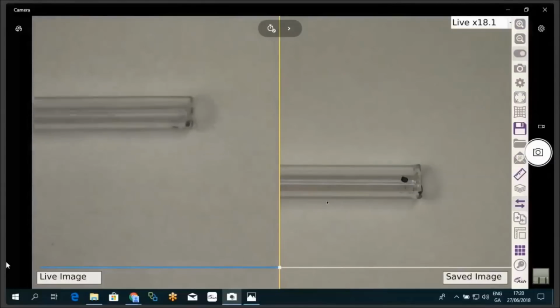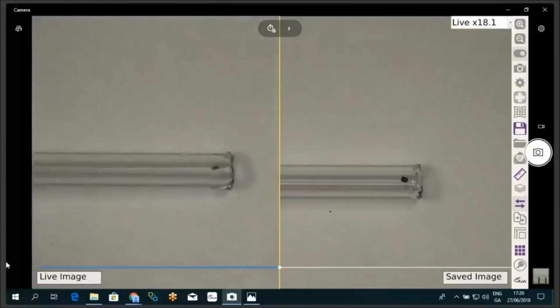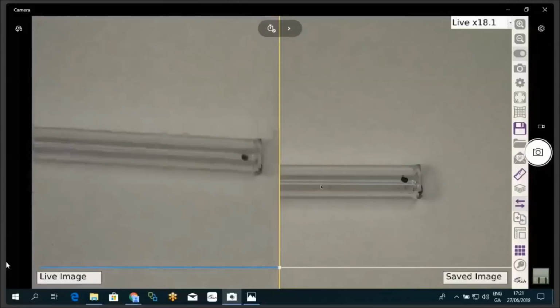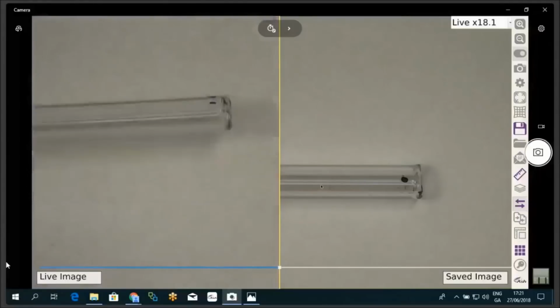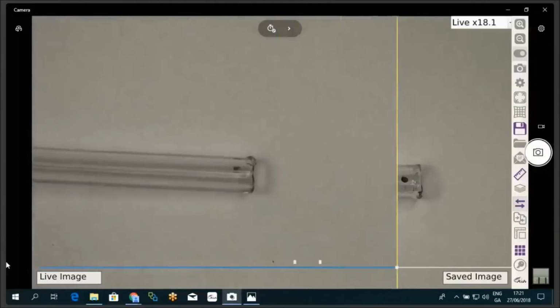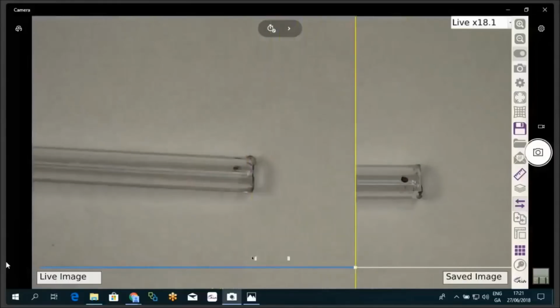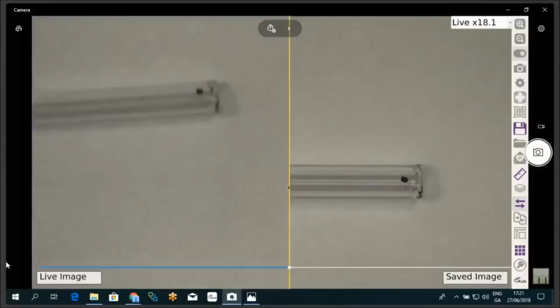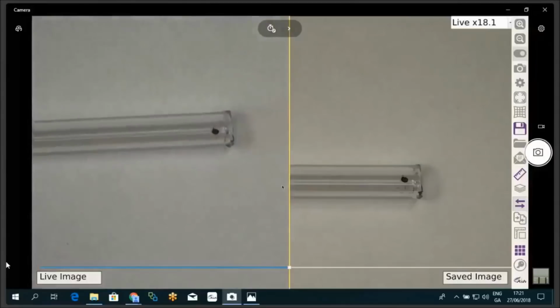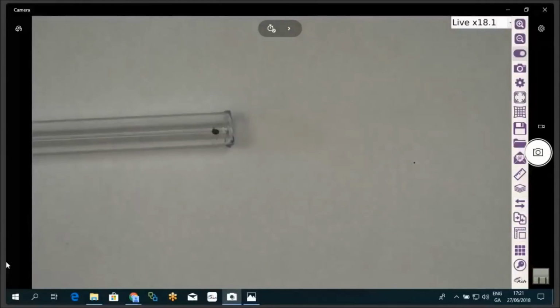So I can actually compare. Again, you're looking for any foreign material, any dents or abnormalities in the mold. And this can apply to any industry, to any part. This split screen here, we can control the middle line. We can even save this whole frame as an image, again, to report back to maybe a supplier or customer and to provide evidence of fault or lack of failure. I'll just exit out of that. So that's image comparison.